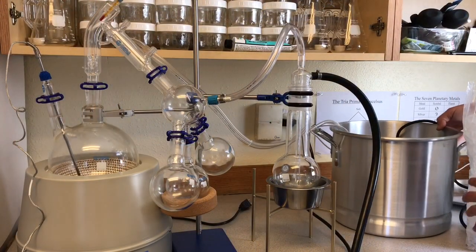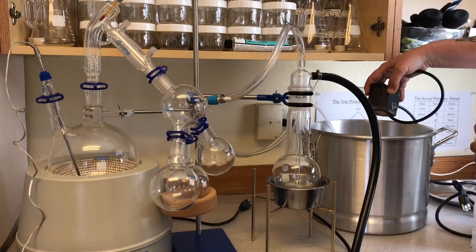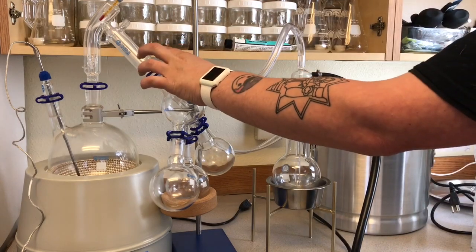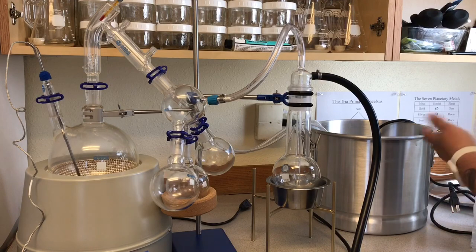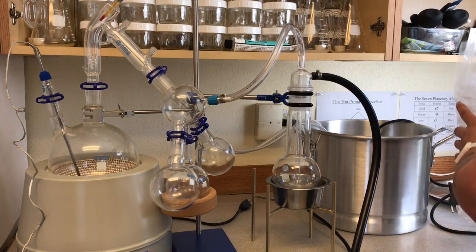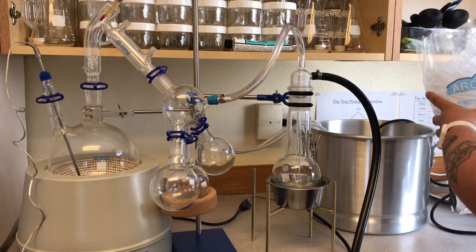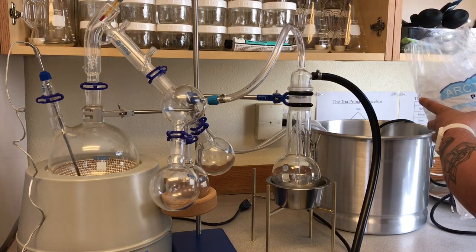So in my pot here, I've got a little pump, and this pump is going to pump the water into our cool water condenser. It's going to come into this connection and out of this connection, and that's just a used fish pump that I found at the local pet store. It was super cheap, I think maybe $10. We're going to take our ice and pour it into here and put some water, and it's important that you put the ice in the water before you plug in the pump. If you plug in the pump dry, it will die, so you want to be careful with that.